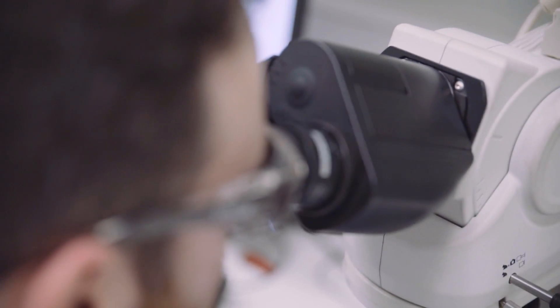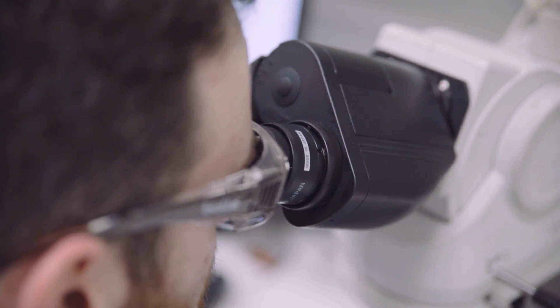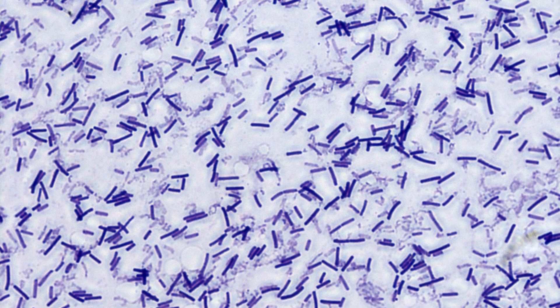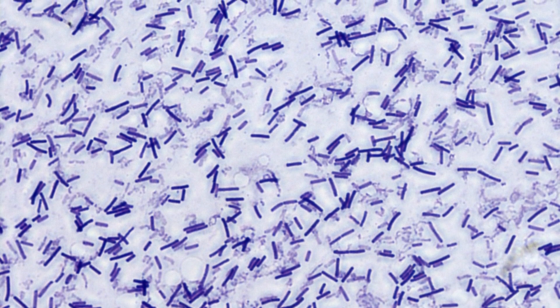You can see here the long purple strips of the actively growing C. diff, and there are lots and lots of them.